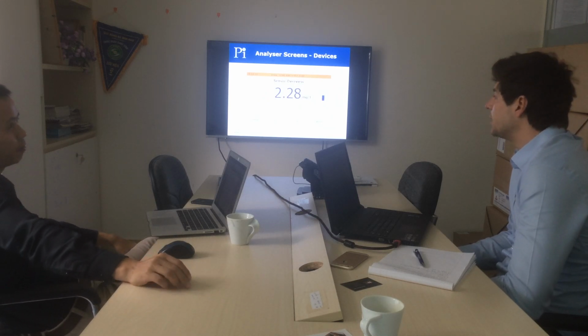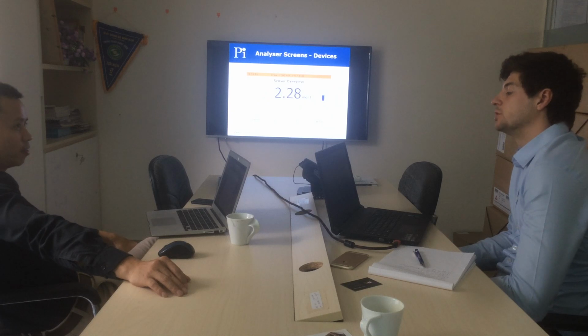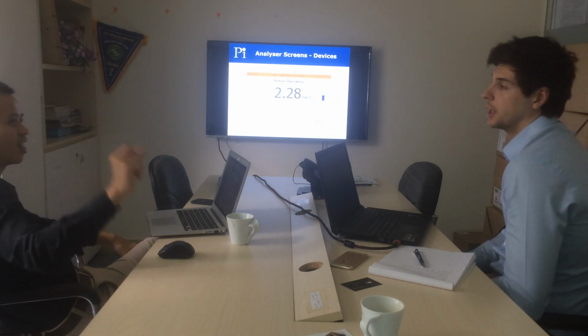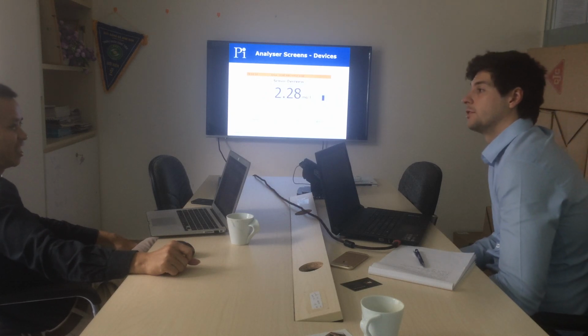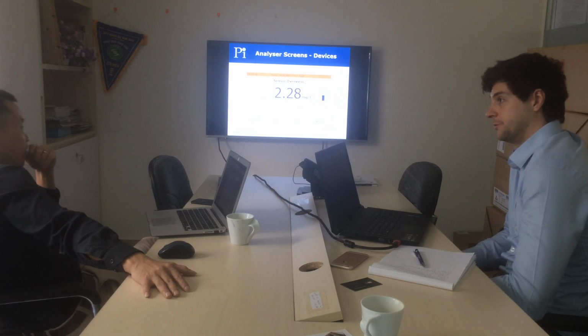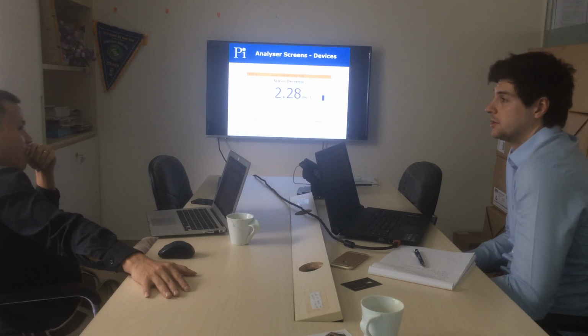Yeah, well, we do have a big range. But sometimes people want to use other sensors, or they may also want sensors that we can't provide. For instance, ammonia. We don't provide ammonia, so for us we need to accept these.